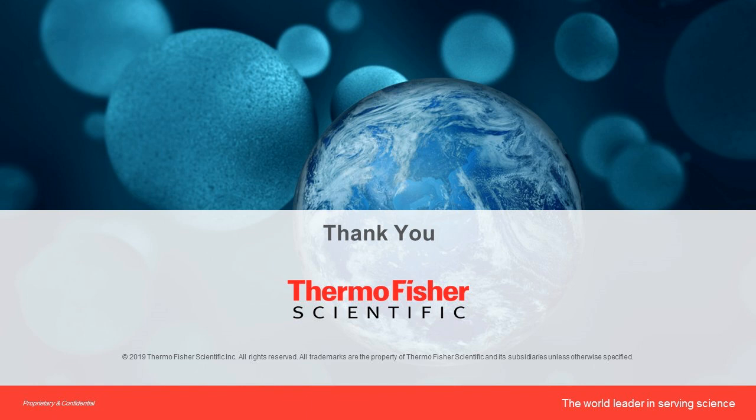Yeah, great question. So up until this point, we've been using TEM as the way to inspect the impurity elements in the preps that we have. So through TEM, you can pick up the presence of baculovirus or even debris.